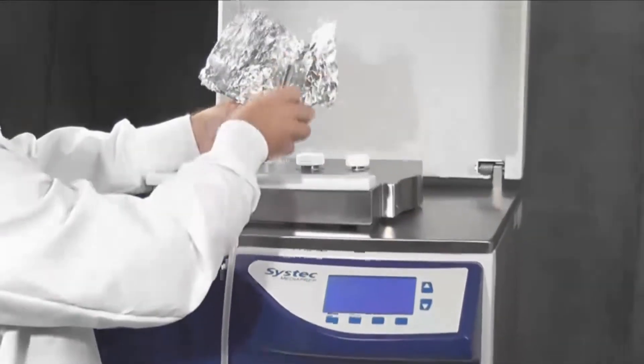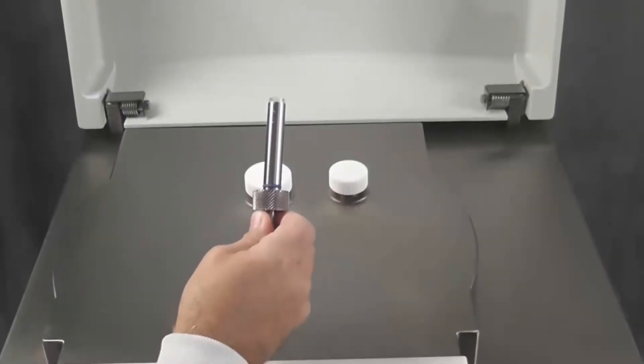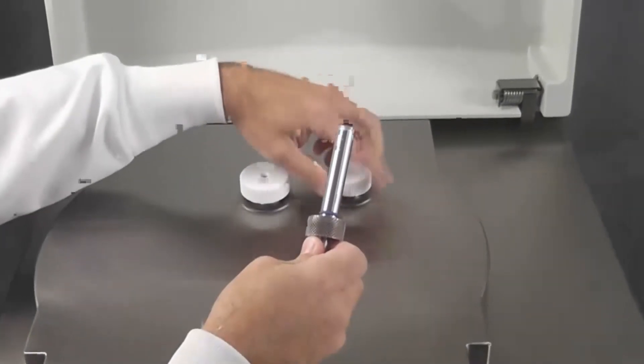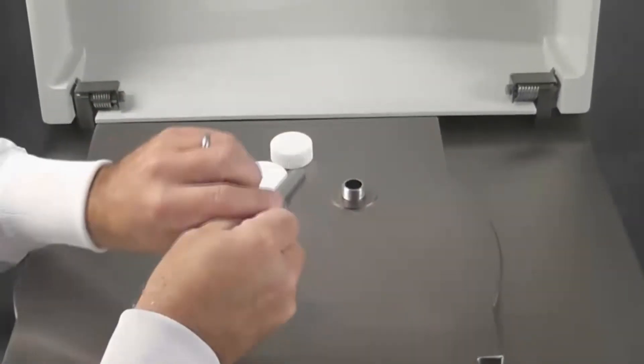After sterilization is complete, take the dispensing tube which has been autoclaved. Remove the filling cap and insert the dispensing tube.